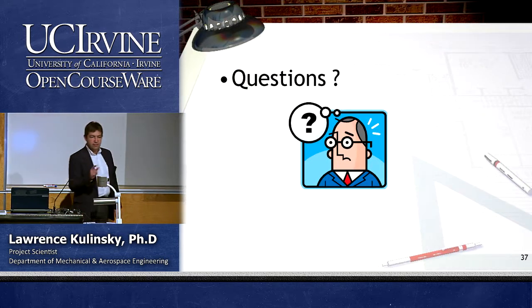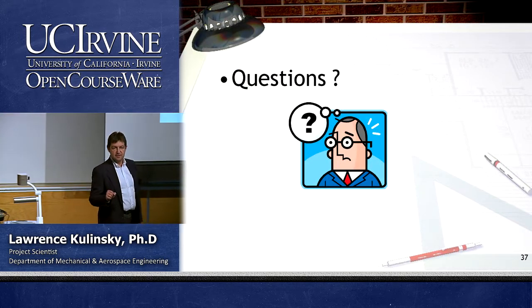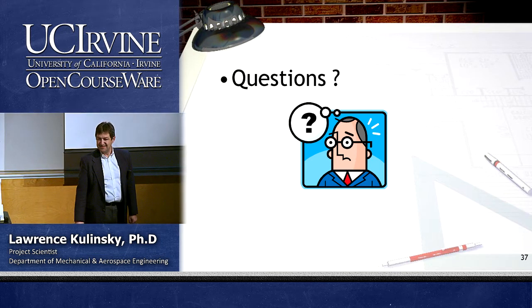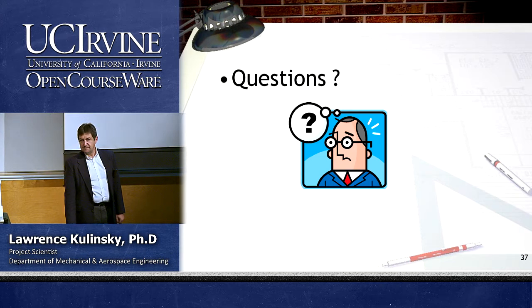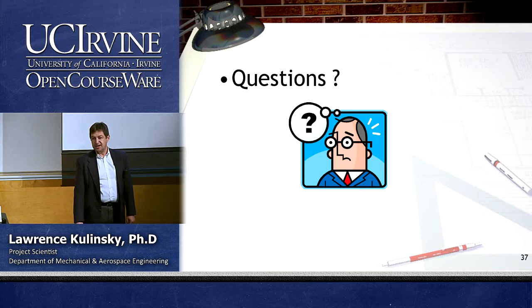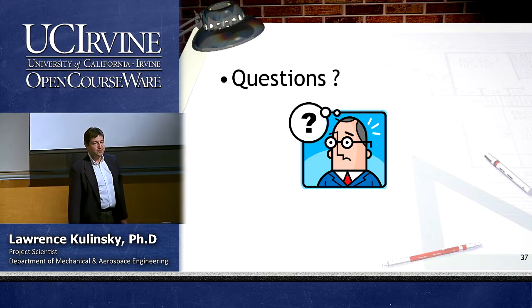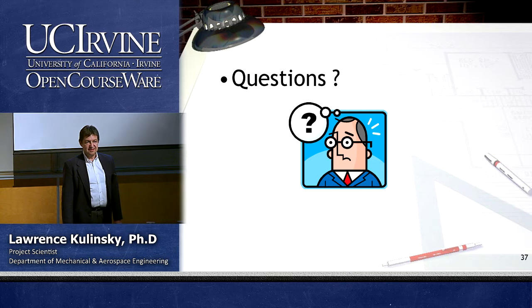So do you have questions up to now? Yes? No? What then, for the previous slide, does it need to have a transparent sample now, or with this? Yes, you need to, because the light needs to go through.